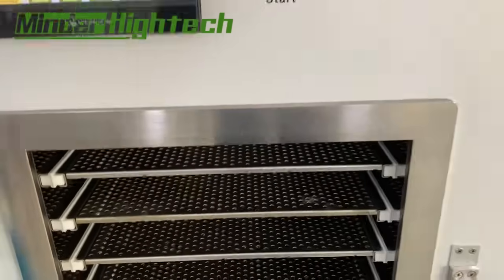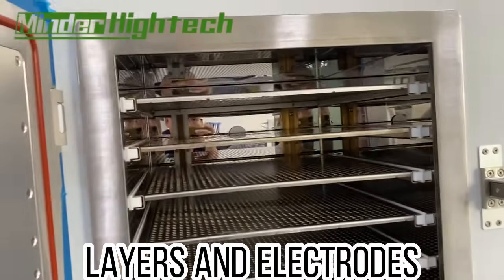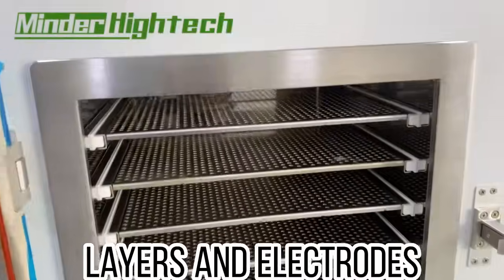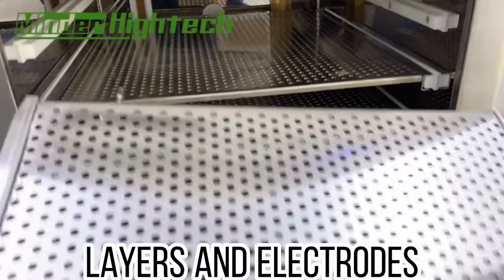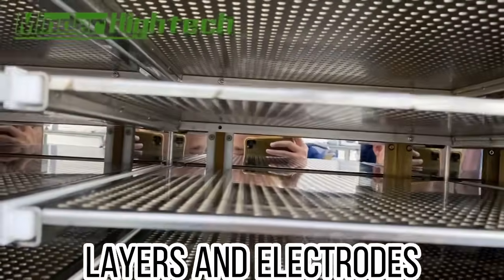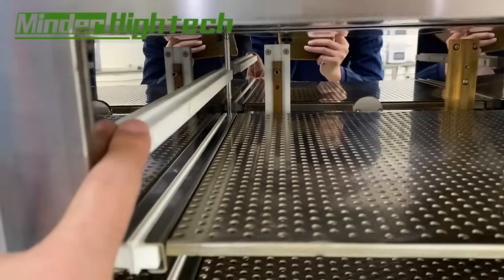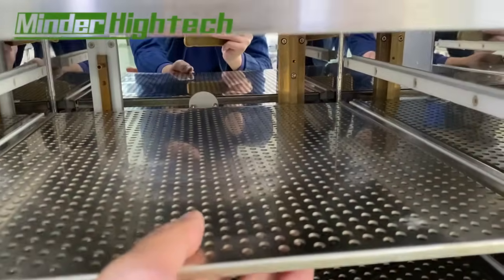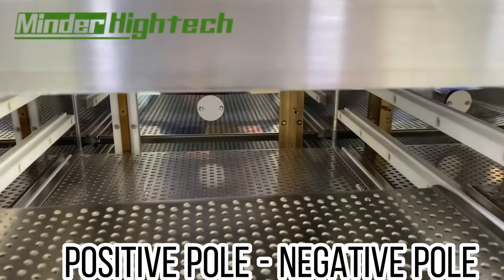Looking at the cavity, the standard configuration has six layers. We need to know: this is a positive electrode — it is connected here. This electrode is positive, and the next one is negative.